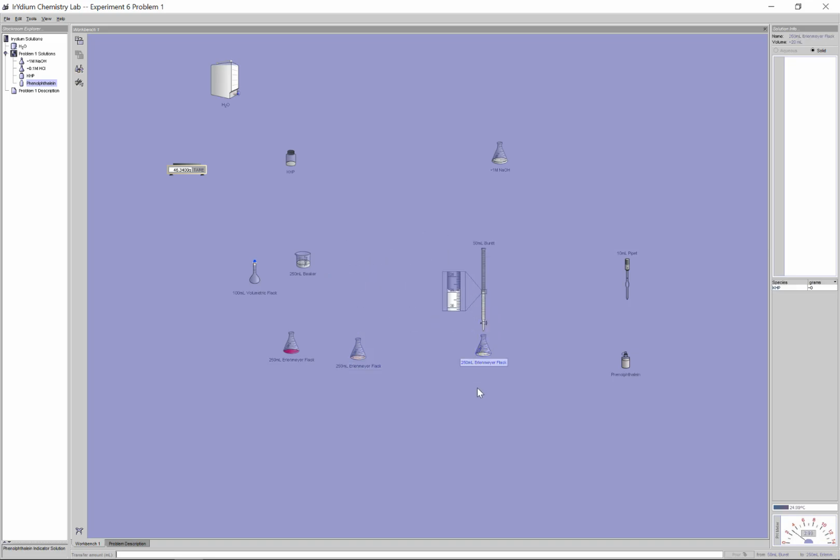As I drop this in here, looking at the volume that I needed previously, that was about 8.71. So again, I know I'm pretty safe here. Let's drop in maybe 7 milliliters at a time. So let's drop in 7, right? That shouldn't have overdone it there. I pour that in there, good, no problem. And now we're getting pretty close to that 8.71. So let's drop it in maybe again 0.2 at a time. And then I'm going to drop it in here. All right, 7.2, 7.4, 7.6, 7.8, 8.